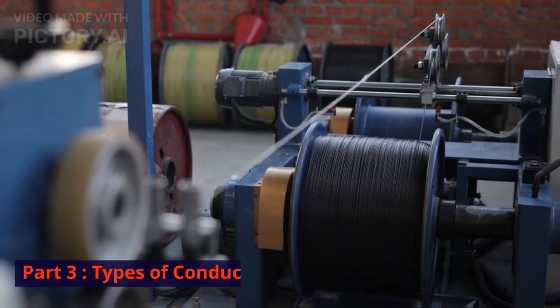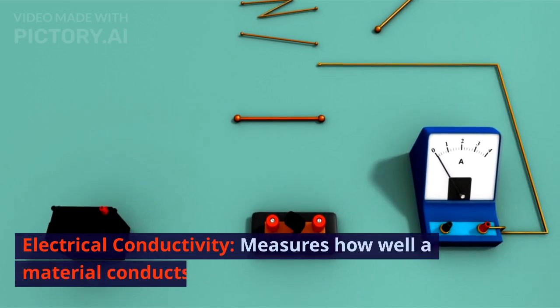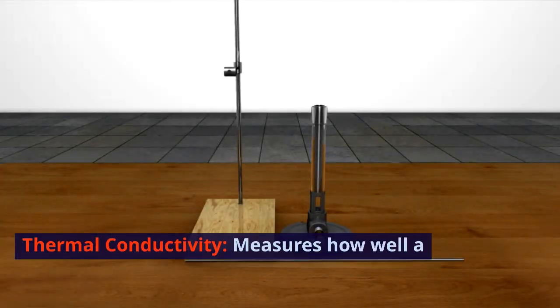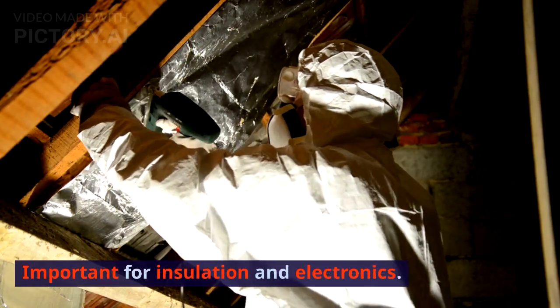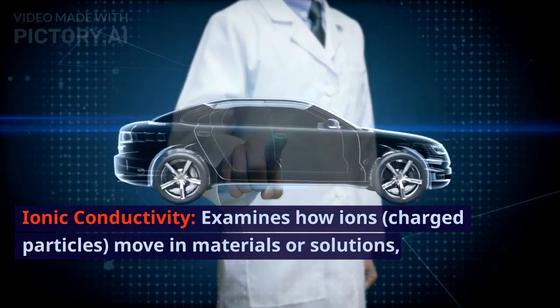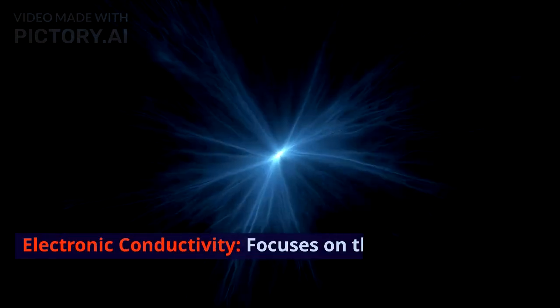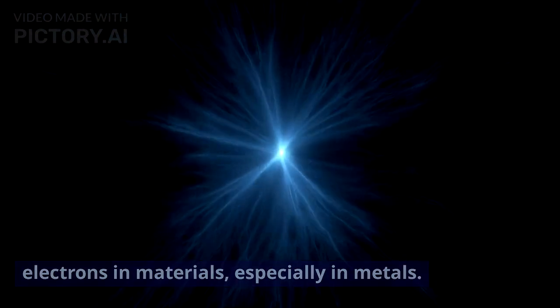Part 3. Types of conductivity. Electrical conductivity measures how well a material conducts electricity. Used for metals and solutions. Thermal conductivity measures how well a material conducts heat. Important for insulation and electronics. Ionic conductivity examines how ions, charged particles, move in materials or solutions, often in batteries. Electronic conductivity focuses on the flow of electrons in materials, especially in metals.